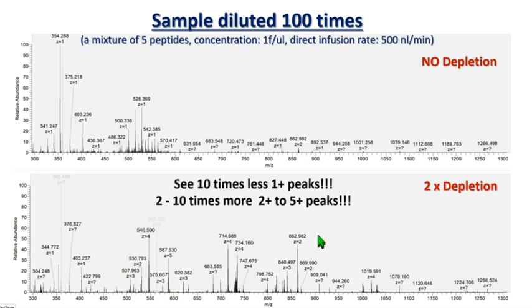Now he's putting an HPLC system in front of this instrument, and actually he did already analyze in his initial experiments, where he would use a very small amount of sample and use depletion mode to observe this sample.